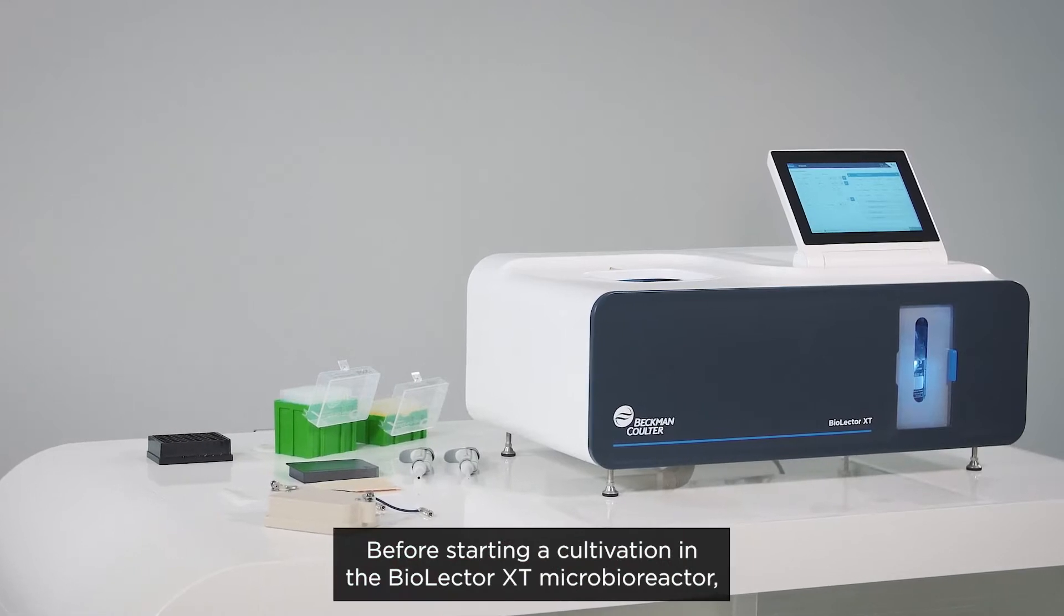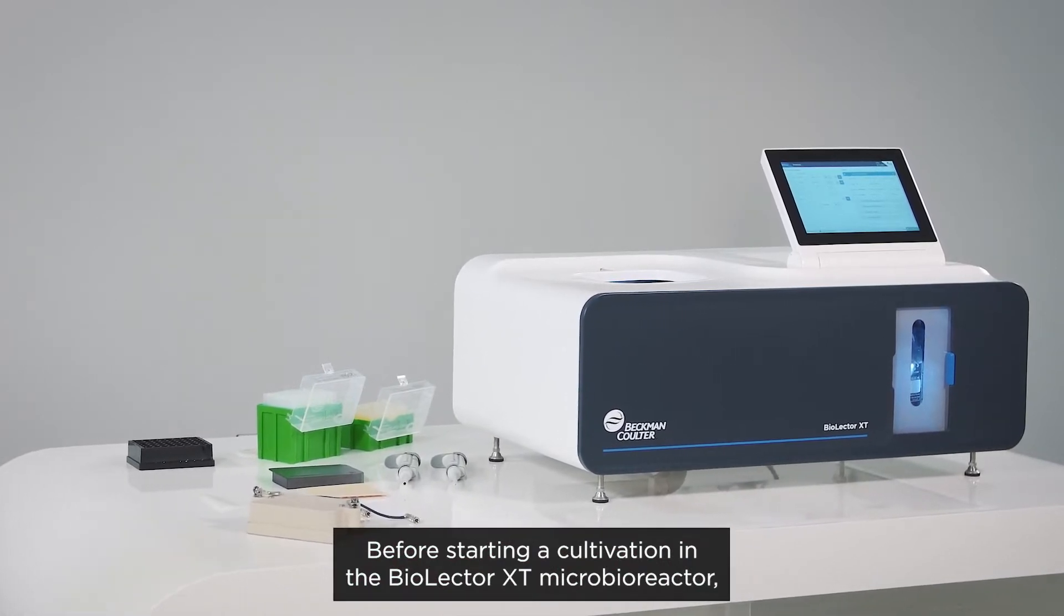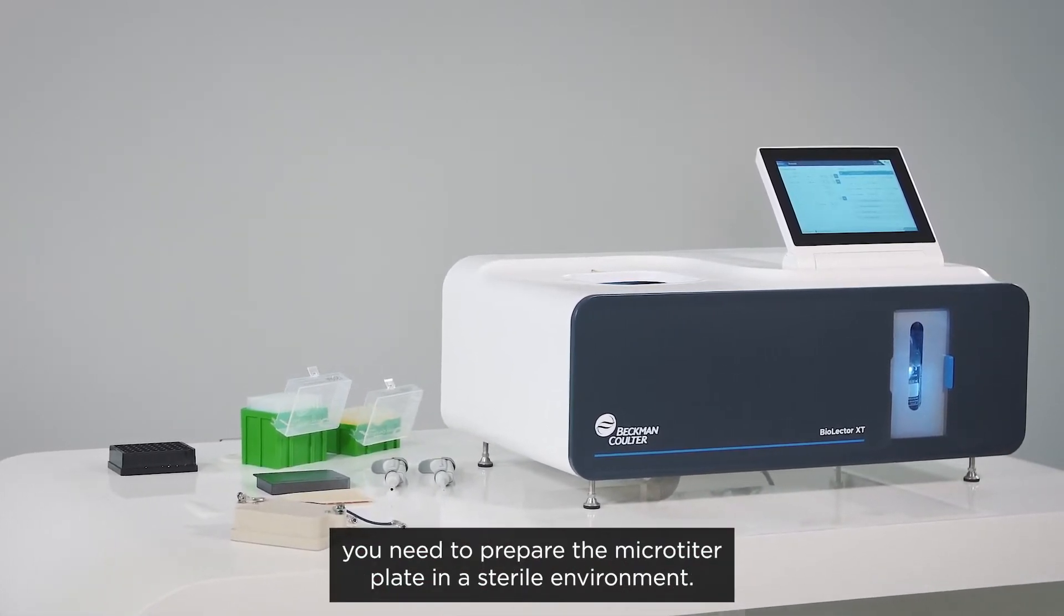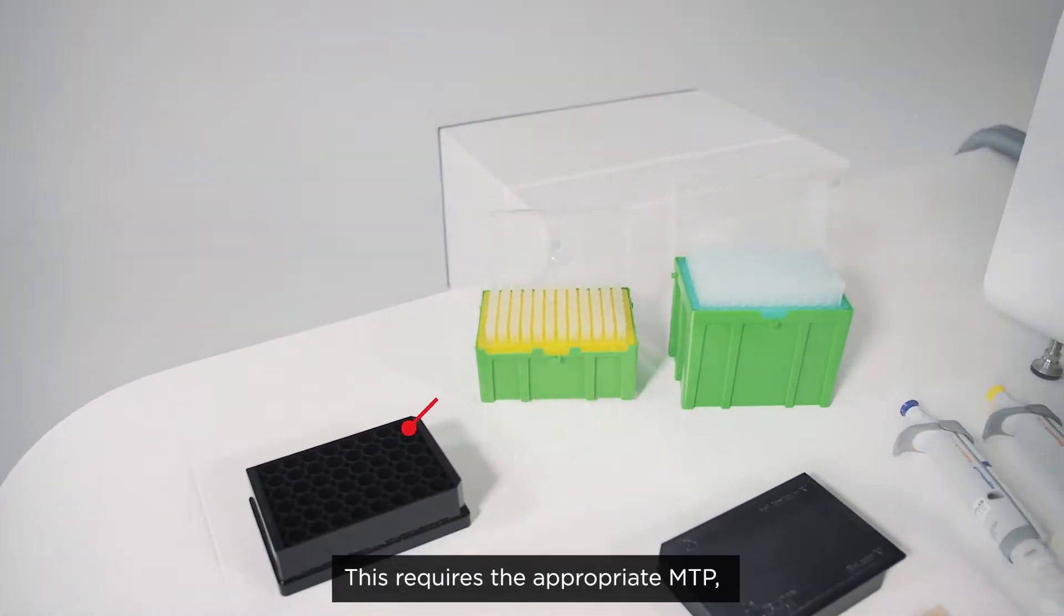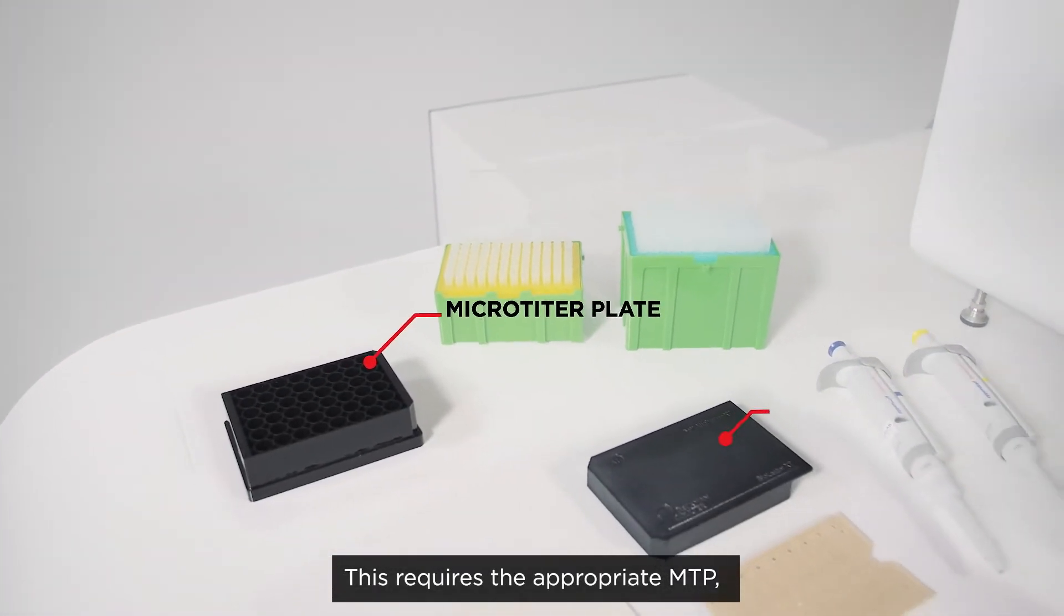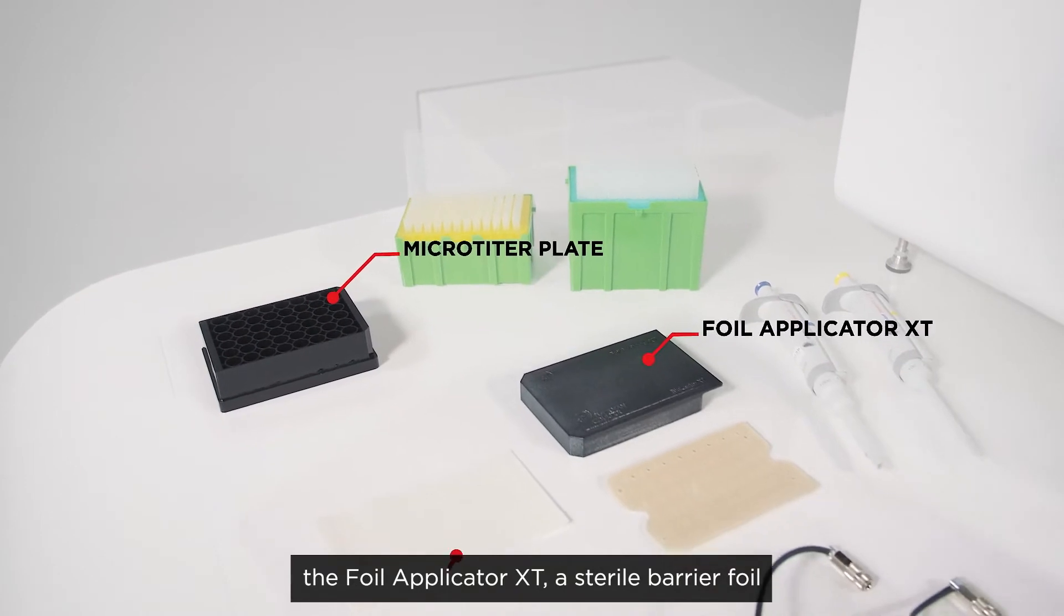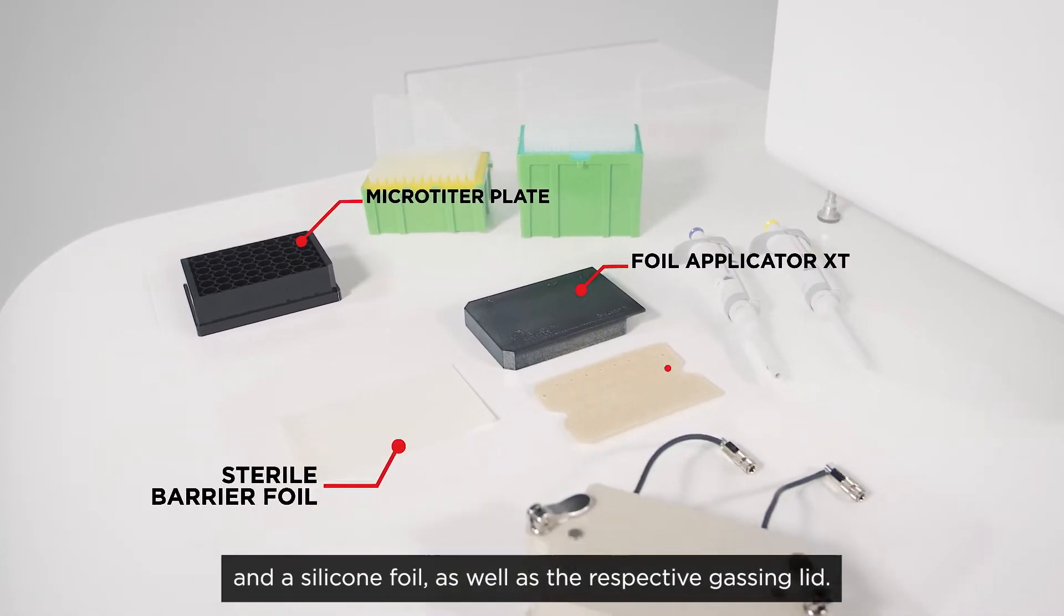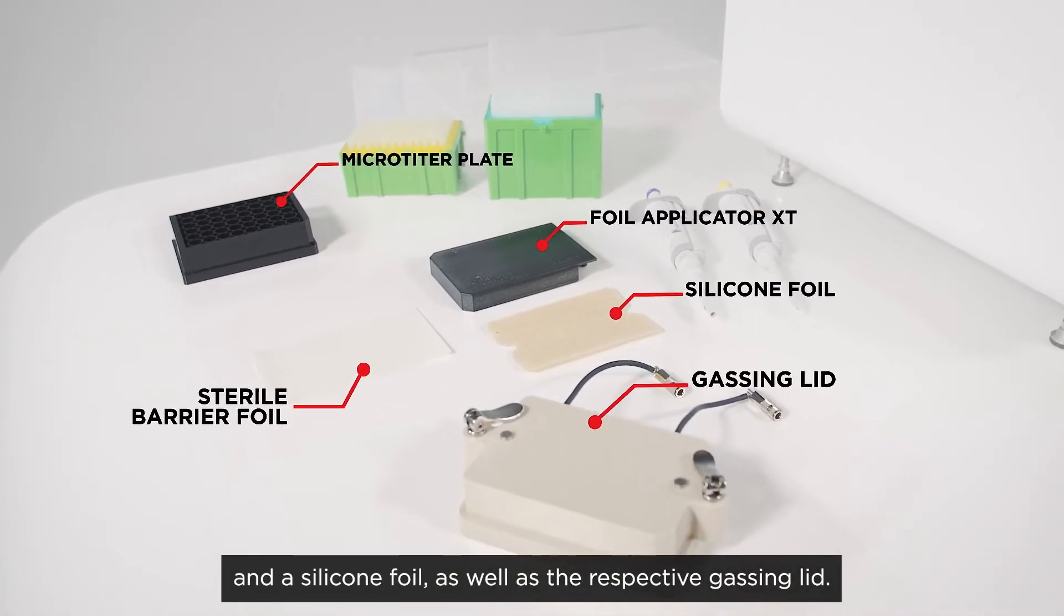Before starting a cultivation in the BioElector XT Microbioreactor, you need to prepare the microtiter plate in a sterile environment. This requires the appropriate MTP, the Foil Applicator XT, a sterile barrier foil, a silicone foil, and the respective gassing lid.